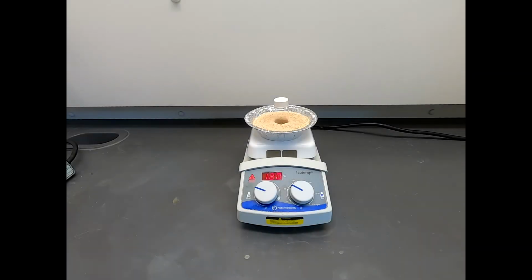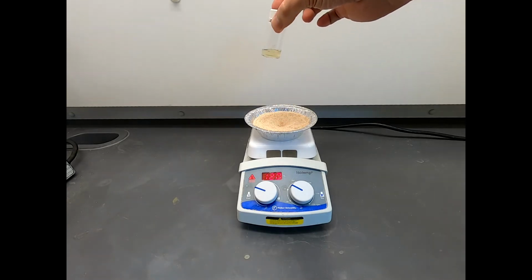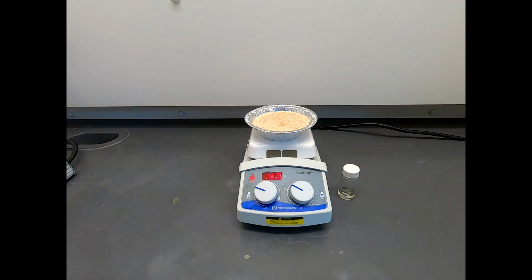All right, this has now been going for 4 hours. And I pull this out. It looks very much the same. It's just been heating that ethanol solution. And now I'm just going to put that on the side. We'll let that cool down, and then we'll continue working this up and getting that product isolated.